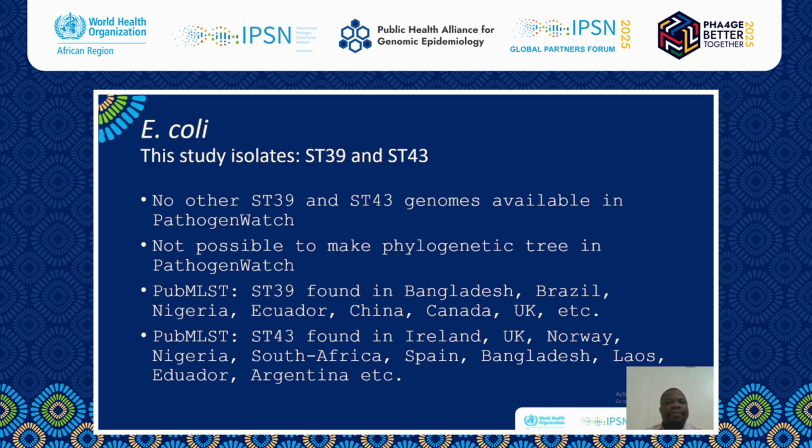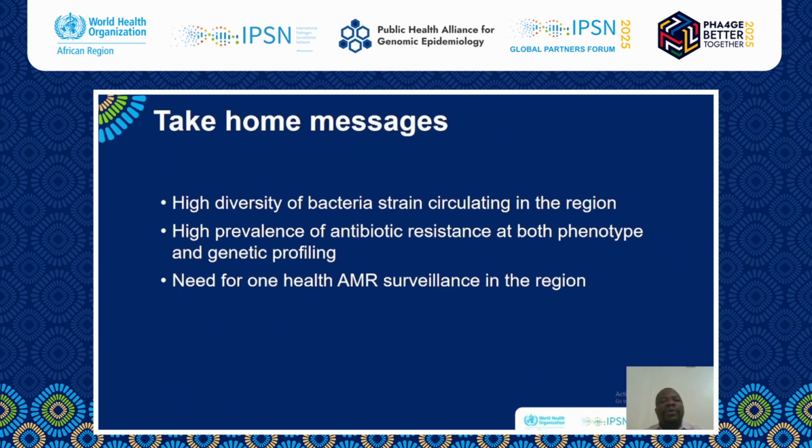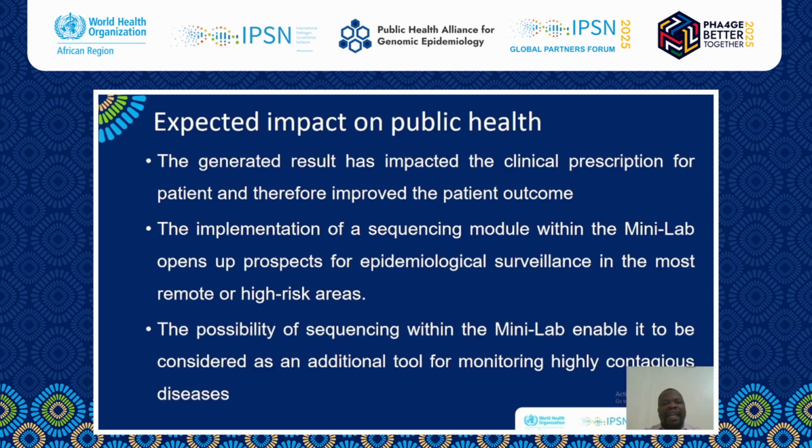So from this project, we have been able to generate results that have impacted the clinical prescription and the patient outcome, the implementation of sequencing modules within the mini lab, and that opens a prospect for epidemiological surveillance.